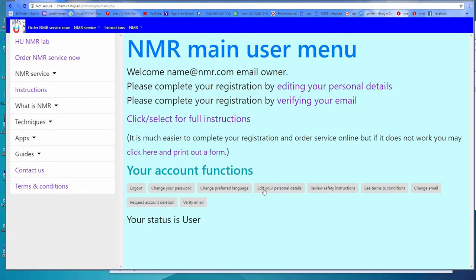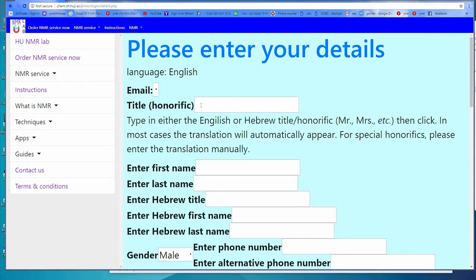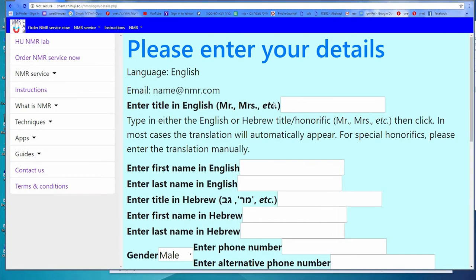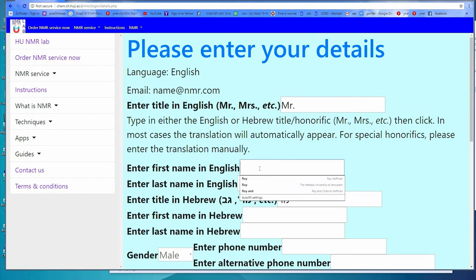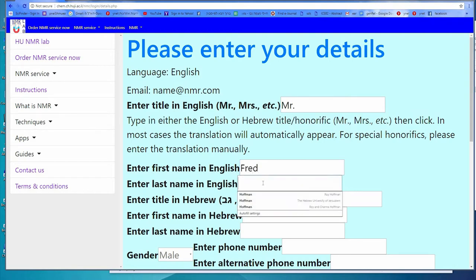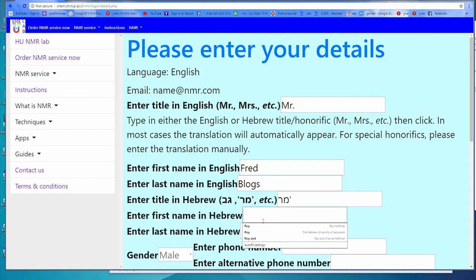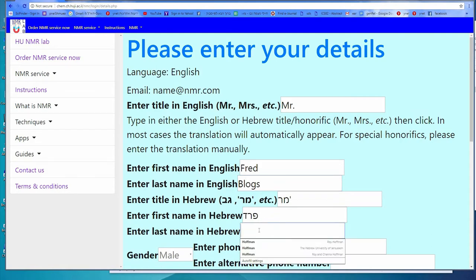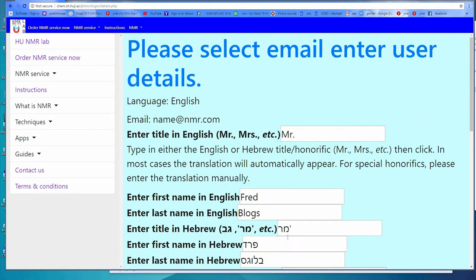After creating your account, please edit your personal details, starting with the title or honorific. If you type in the correct name, it will automatically translate to Hebrew. Then enter your name in English and in Hebrew. If you don't know how to write your name in Hebrew, please call us to help you with that.